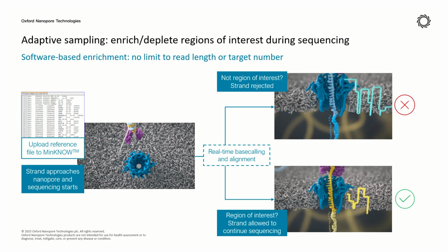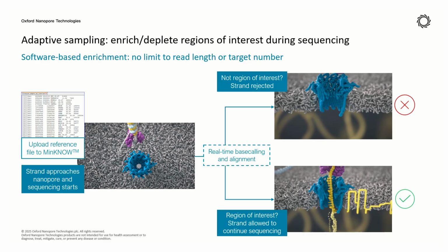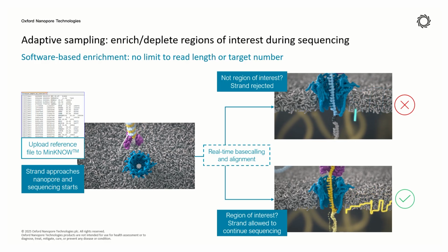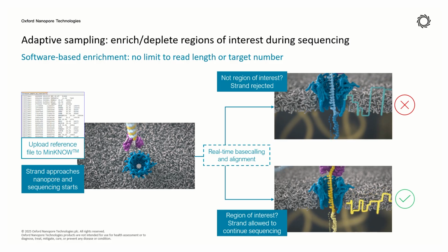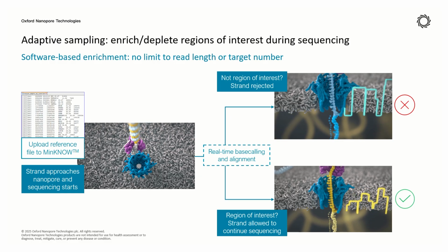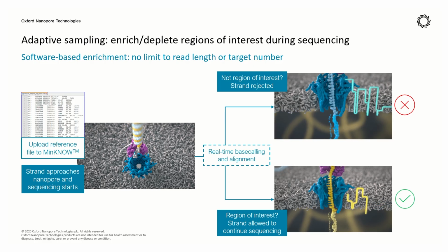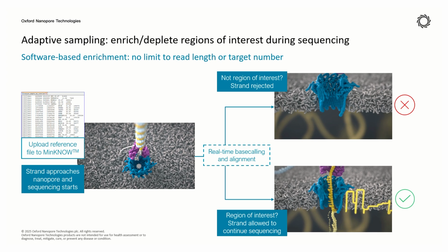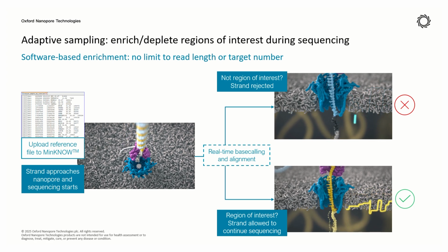with the way the technology works, fundamentally the technology doesn't change between iterations. And this allows for really exciting things where we have this targeted sequencing approach called adaptive sampling. So this is targeted enrichment of particular regions of the genome. But because it's based on mapping reads against the genome, it also means if we want to add new sites, we don't need to revalidate, unlike, for example, if I was using a primer-based approach where you need to validate those primers and go through iterations of that validation.